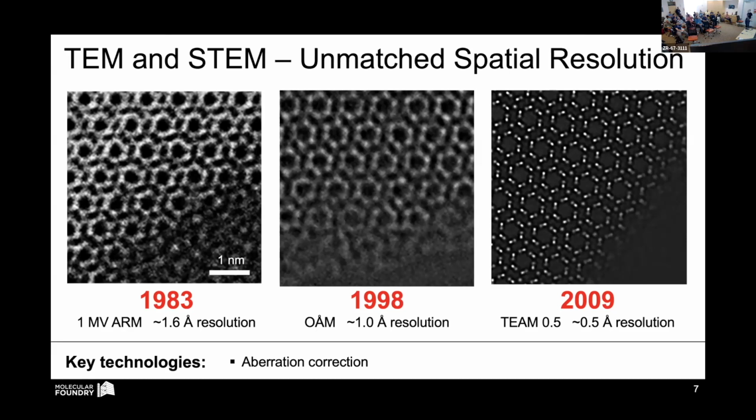That it were so easy with X-rays. We also primarily, these days, have improved by using better detectors, so direct electron detectors. No more scintillators that convert electrons into photons. We go directly from electrons into CMOS semiconductor type chips that convert directly into electrical charge, but also computation leverage. And that's mostly what I'm going to show today here.